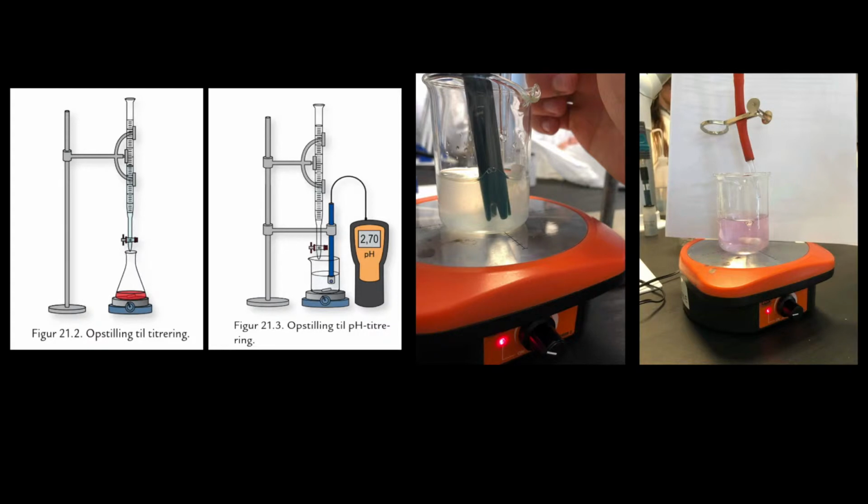The first one was a colorimetric titration with sodium hydroxide and just plain citric acid. We used phenolphthalein, which changes the solution to a red color like this when the pH is about 9. Afterwards we did another titration, still with sodium hydroxide and just plain citric acid.